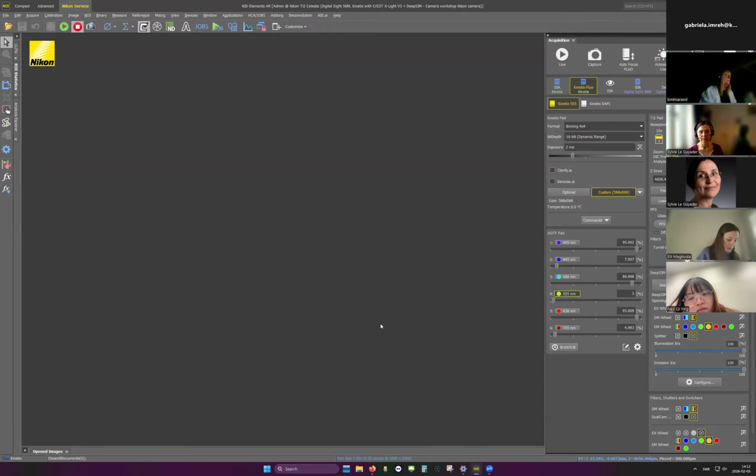So it expresses basically the ability to see bright and dim structures in the image. And with this camera, most CMOS cameras have different dynamic ranges from 8 to 16.